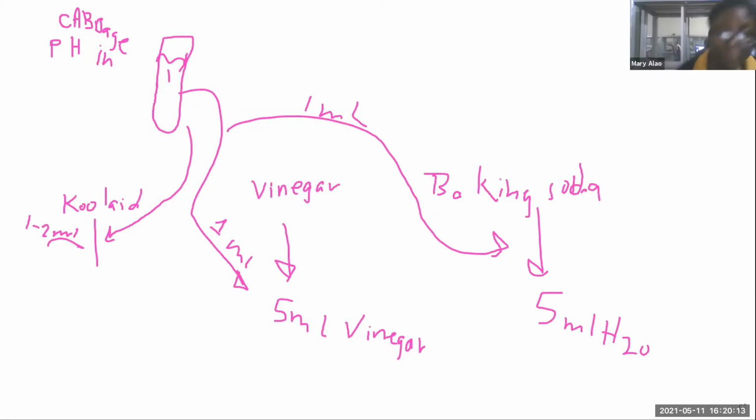Dr. Henry. Yeah. Okay, so for part 2, it says weigh out a quarter teaspoon of baking soda and put in test tube 1. Oh, okay, so that's what I'm saying. For some reason, let me see why. Oh, let me fix that. Don't do that. You're done. Yeah, don't worry about that part. Let me fix that right now. Because you guys don't have test tubes and you don't have a graduated cylinder, I had to modify the lab. Okay.